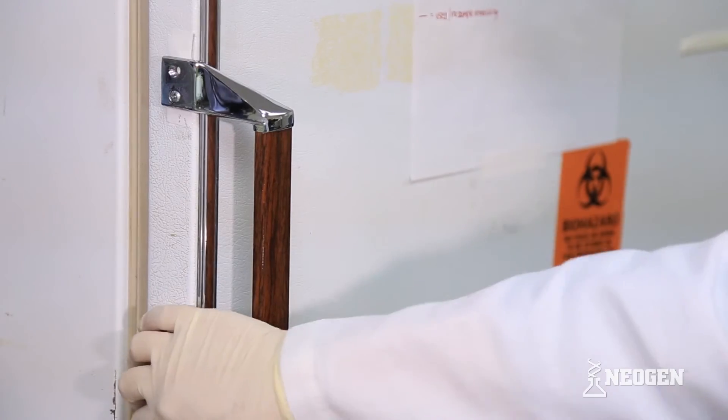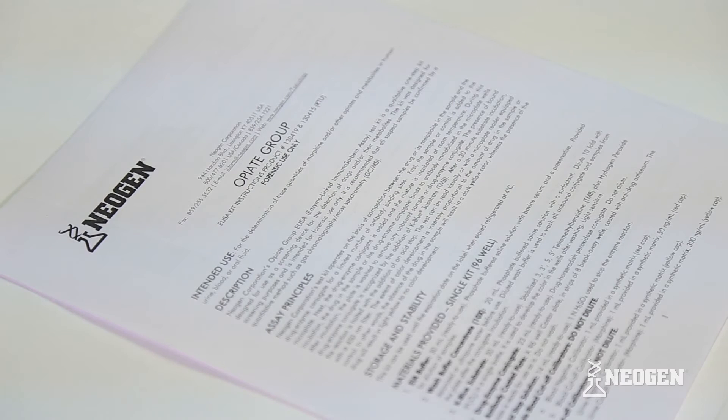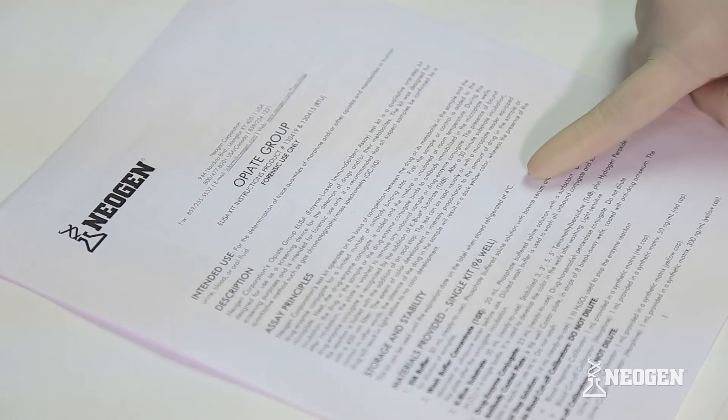Unused kit materials must be stored at 4 degrees Celsius to ensure their stability. Some kit components may require different storage temperatures, so be careful to check the kit insert for storage conditions.